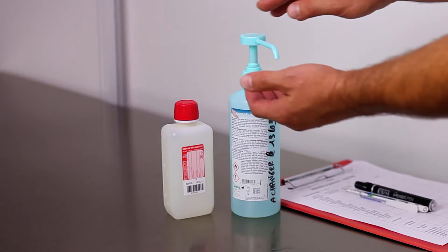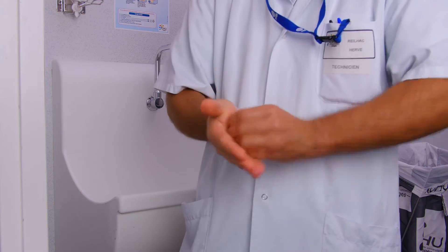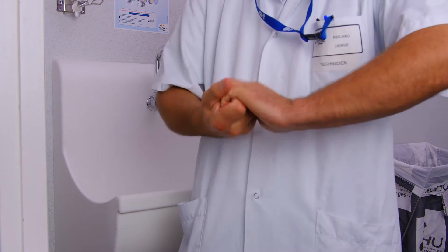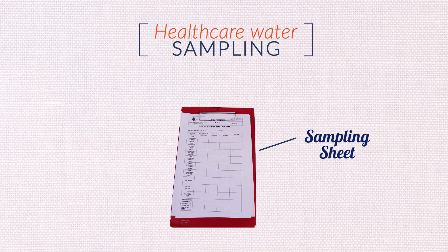The technician complies with hand hygiene regulations by disinfecting before sampling water for healthcare. We'll use one sampling bottle containing a neutralizing agent and one sampling sheet.